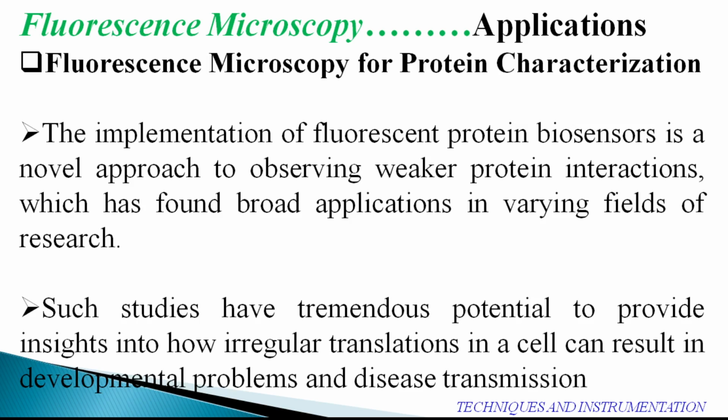And if you remember, my friends, during the previous lecture we came across an aspect of fluorescent microscopy that is very extensively used for dental research, in fact. In dental investigations, especially related to hard tissue, it is definitely possible to carry out detailed insights related to such tissue. And this is actually one of the latest uses in the field of invention by using fluorescent microscopy.